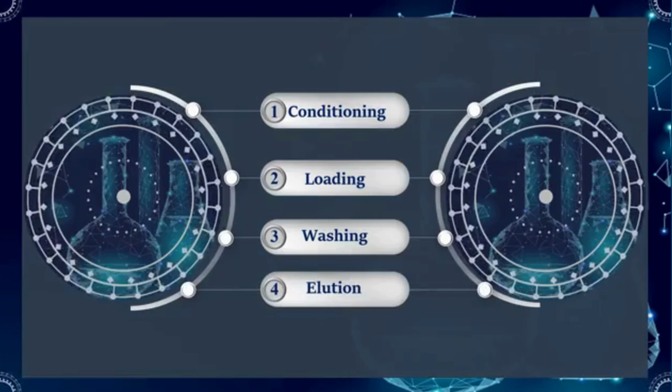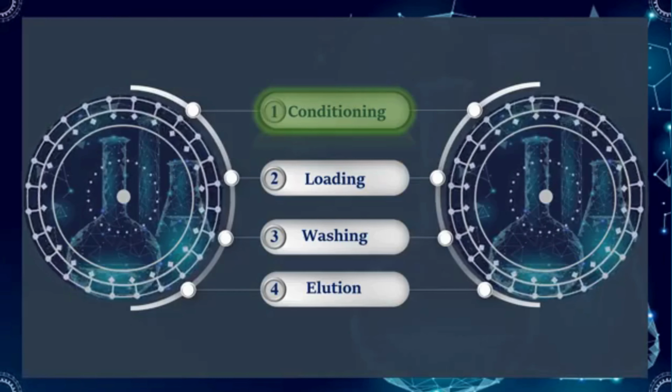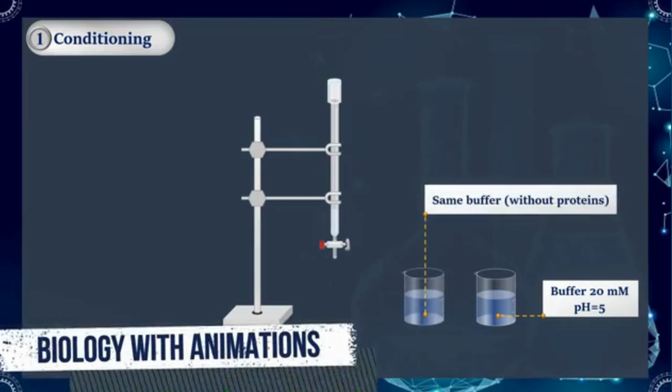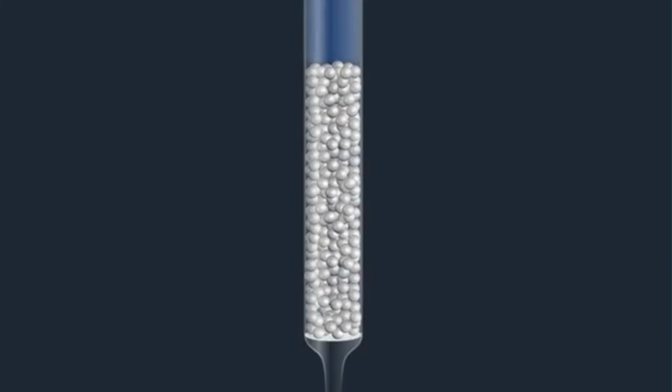Elution is commonly achieved by increasing ionic strength, usually with NaCl, allowing salt ions to compete for exchange sites, changing pH, altering the ionization state and therefore the charge of the analyte, changing counterion composition, or using specialized displacement conditions. Modern IEX separations therefore depend on careful control of pH, conductivity, temperature, flow rate, and stationary phase capacity.